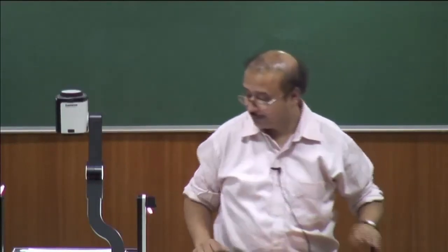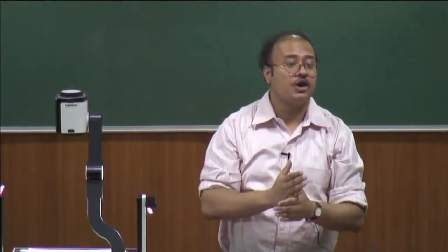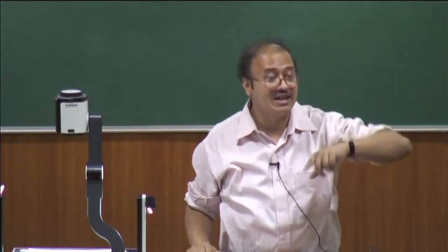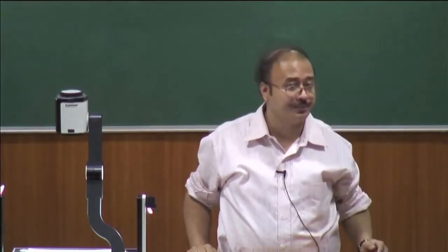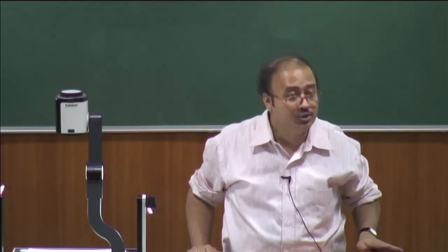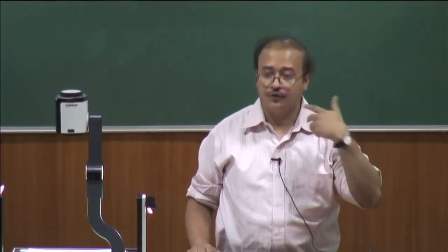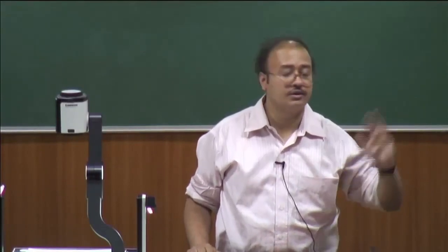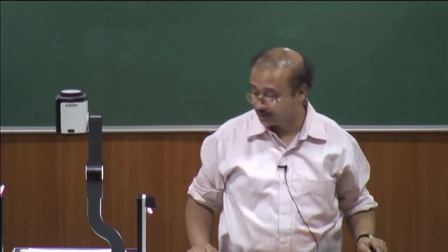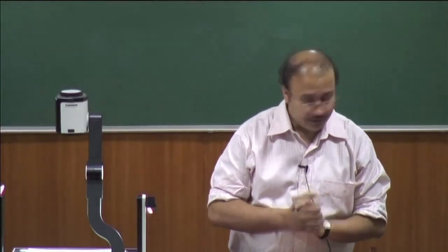Like that. Good. Okay, now, this was your time resolved measurement. So, time resolved means you have excited a molecule, right? And then you are looking at its progress, that means its decay from the excited state to the ground state as a function of time, right? So, that is why there are time resolved spectrofluorometers, which do this job routinely for you. You excite and then it comes down and you fit it to a certain functional form, and you extract your parameters, okay, tau and all these things. Now, we would not be discussing that at much length.